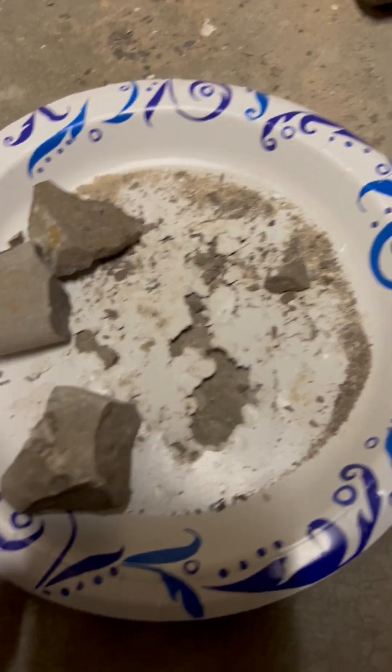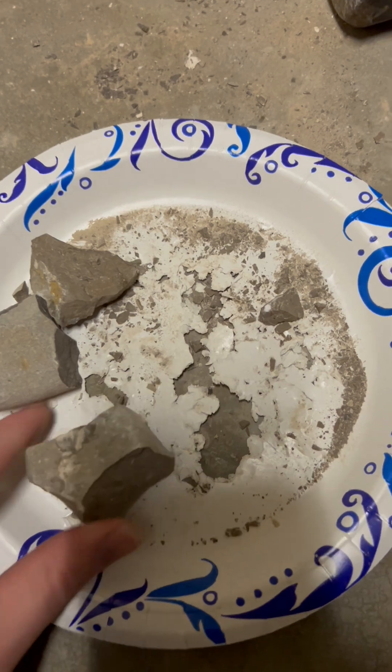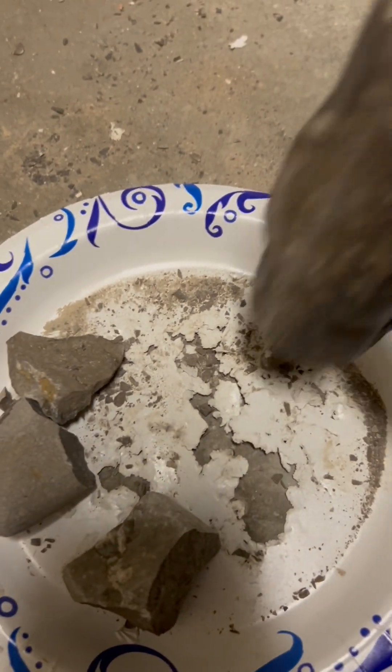This is limestone — Fossil Woofer limestone from Michigan, Devonian in age. We're going to extract microfossils from it.